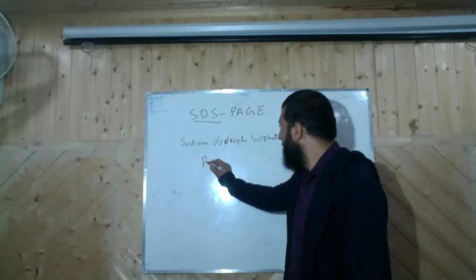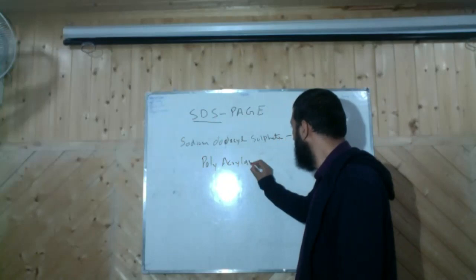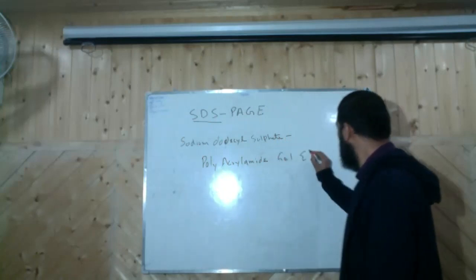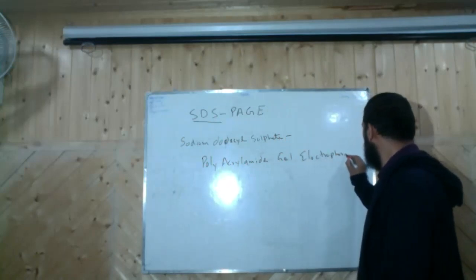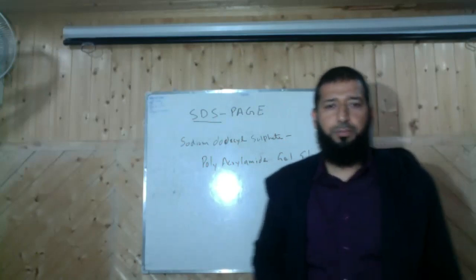PAGE stands for polyacrylamide gel electrophoresis.